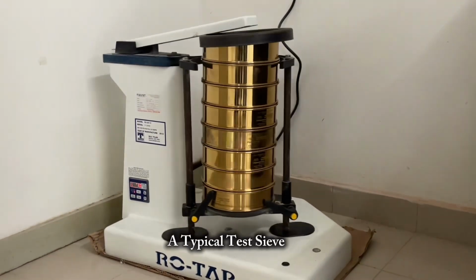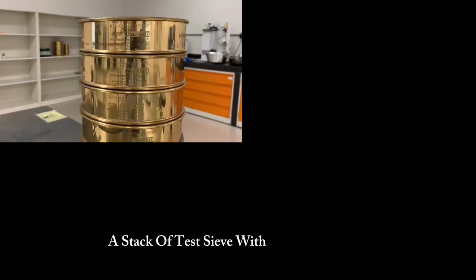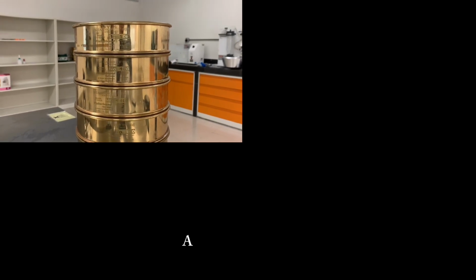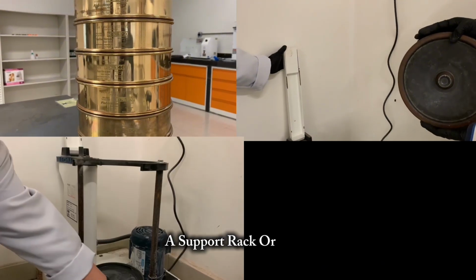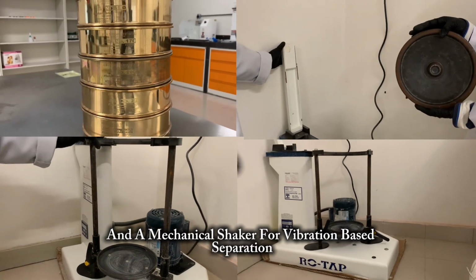A typical test sieve rack consists of several components: a stack of test sieves with varying mesh sizes, a sieve lid and pan, a support rack or holder, and a mechanical shaker for vibration-based separation.